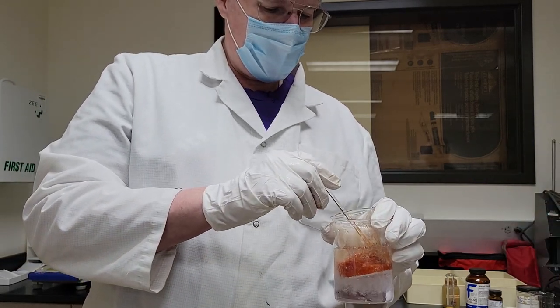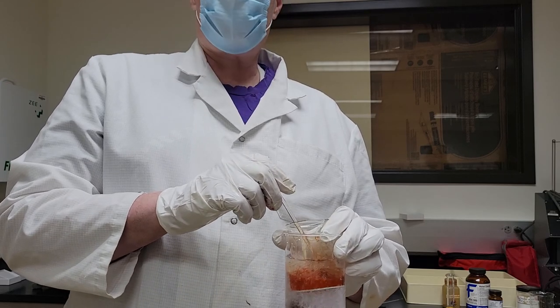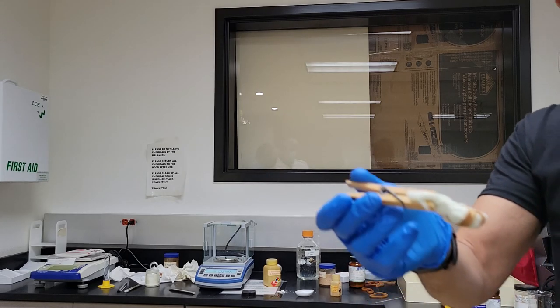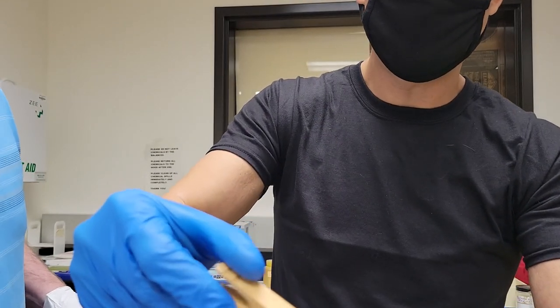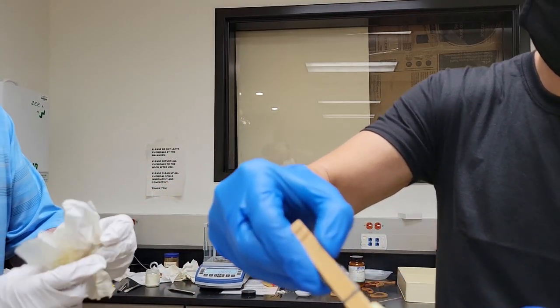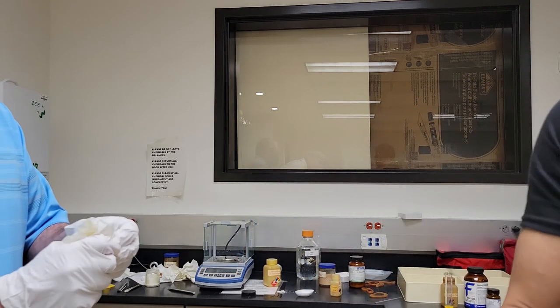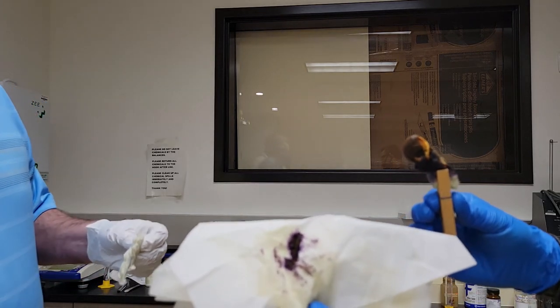I'm going to walk over to the sink now, pull it out of this beaker, and drop it in the sink, because the next thing we have to do is let it sit for a minute and rinse it off completely. Let's see what mine does — because you have a different aromatic, it should change to a different color. Look at that, it's like a bluish-purple almost — you made a blue-purple! The red color is because we're absorbing in the green wavelength — we have enough pi bonds. His is only absorbing in the orange-yellow range, so you'll actually see the purple color more once we rinse it out and unfold it.